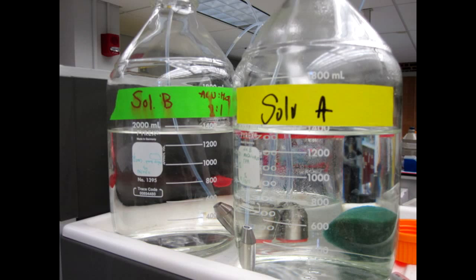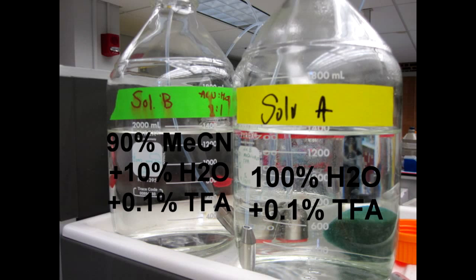Our lab labels these solvents as solvent A and solvent B. A is 100% water and is used to equilibrate the column. Solvent B is added at an increasing rate, which can be modified specifically for each sample. In most cases, we use 90% to 10% ratio of acetonitrile to water for solvent B.